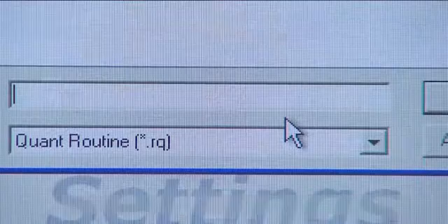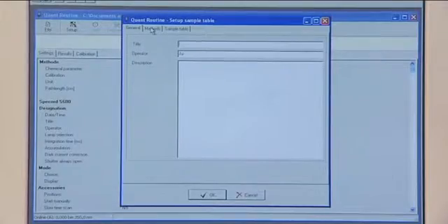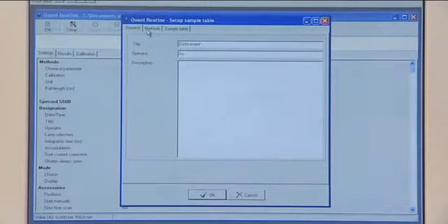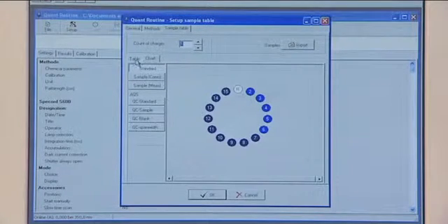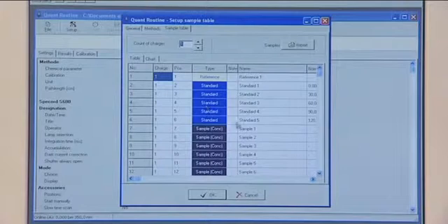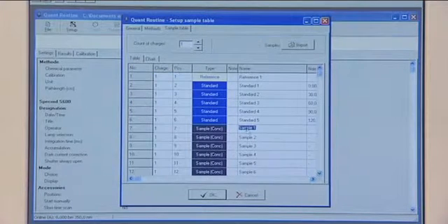The software offers high ease of use for quantitative routine analysis. You can, for example, activate a previous method, fill in sample titles, and you are immediately ready to start. Standards can be measured simultaneously as shown in the example. Already existing calibrations can also be used.